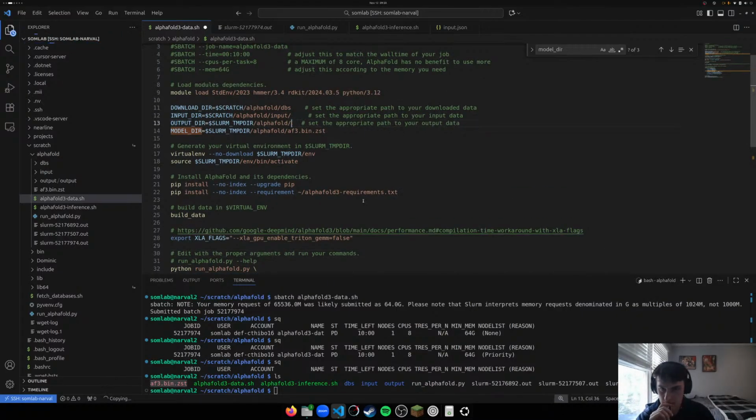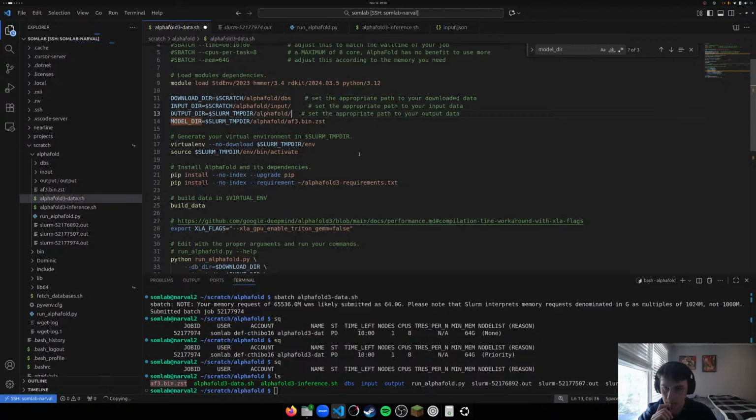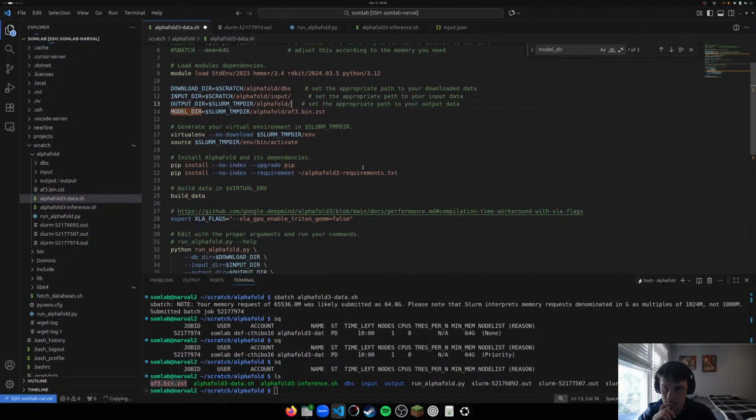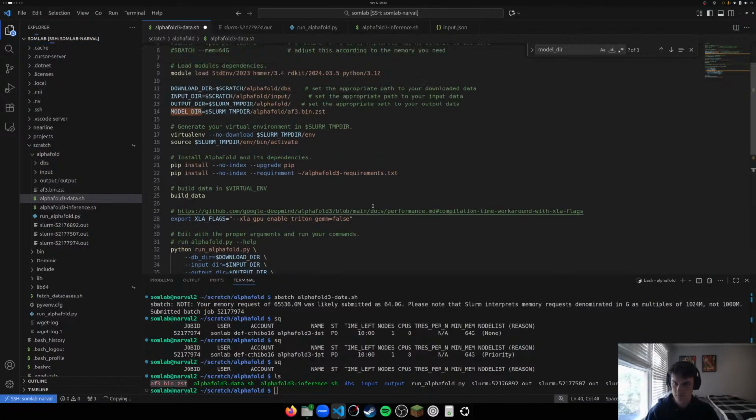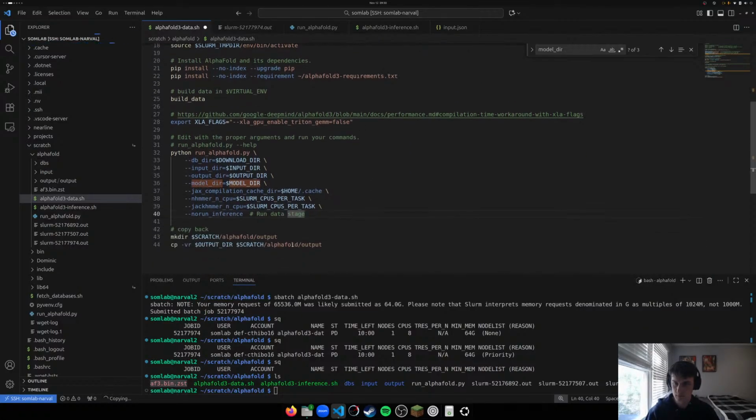Maybe just do this. And why do I need any of this stuff? But I don't know.